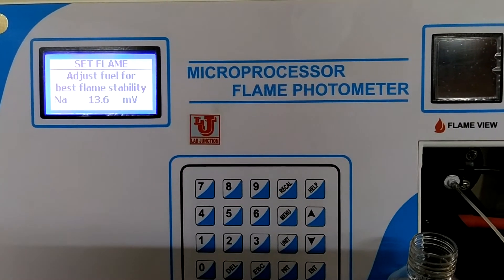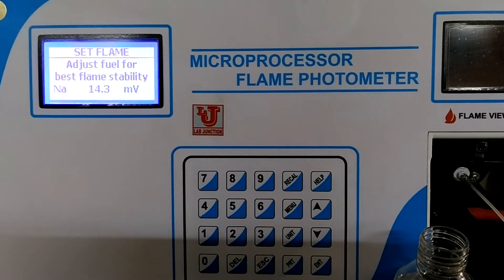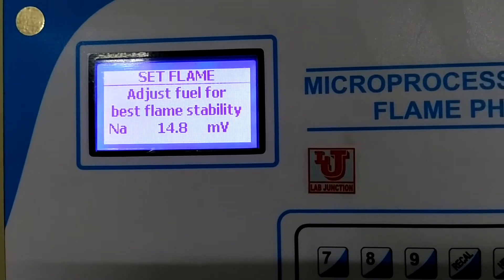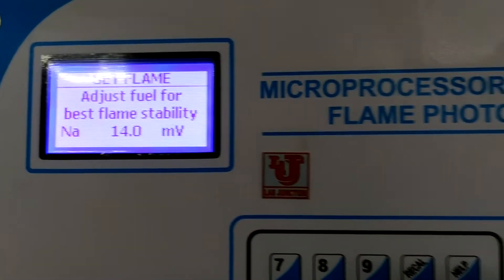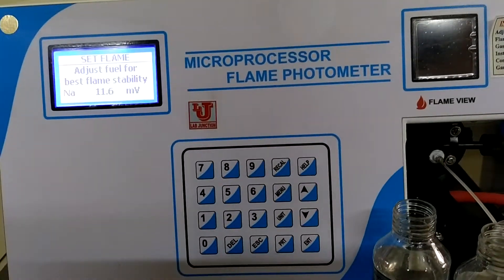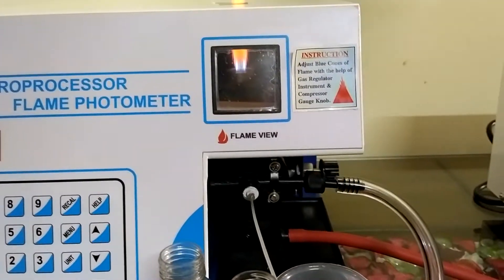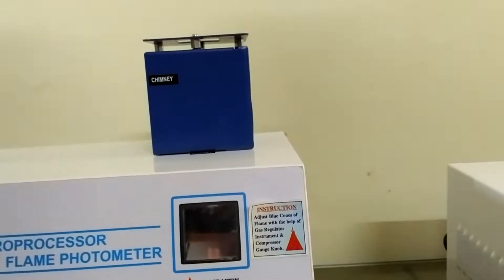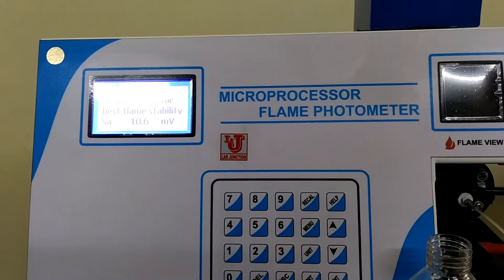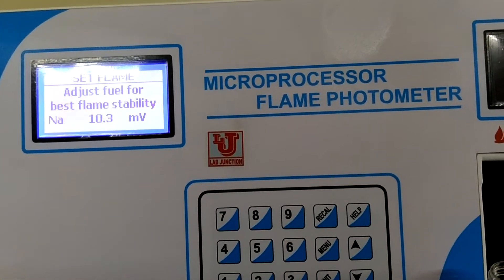In distilled water, some sodium is present. Check the millivolts — if your millivolts are stable, your flame is okay. If you have some problems, put the chimney on the unit. Now you can see the millivolts are stable and not fluctuating much. This is the effect of the chimney.